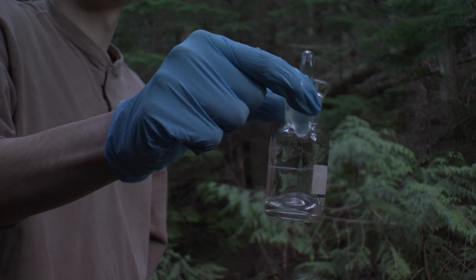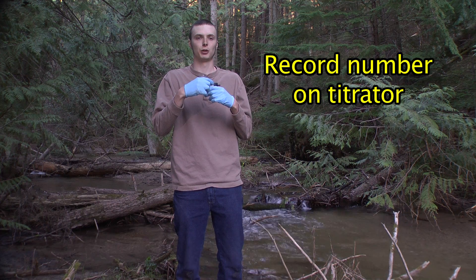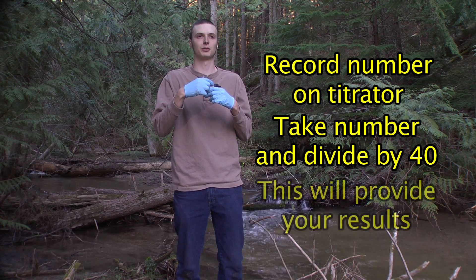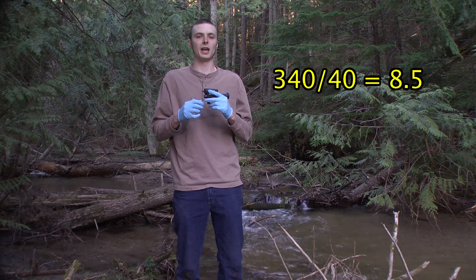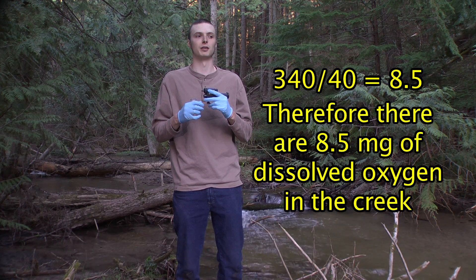Once your solution is clear, you're going to want to record the number on your digital titrator. Take this number and divide it by 40 — that will be how many milligrams per liter of dissolved oxygen you have. For example, 340 divided by 40 is 8.5, so there are 8.5 milligrams of dissolved oxygen in this creek.